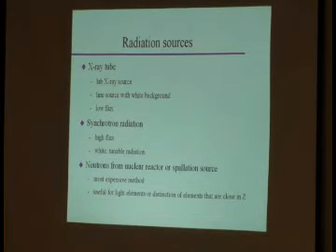If you want higher flux, the synchrotron is your friend, okay? Synchrotron radiation can have very high flux. Synchrotron radiation is actually not a line source, it is white tunable radiation. Okay? So that means you can choose your wavelength, while usually we are kind of bound by the element in our target in a lab X-ray source.